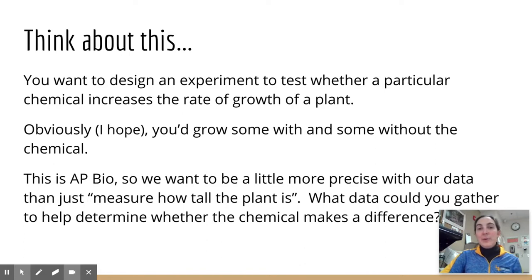Hello. So today we're going to be working on the Mitosis Lab. First I want you to think about experiment design. If you want to design an experiment to test whether a particular chemical increases the rate of growth of a plant, hopefully it's pretty obvious that you would put some in water and some in water with the chemical. So some with the chemical, some without. But the question I want you to think about is how would you measure the rate of growth?